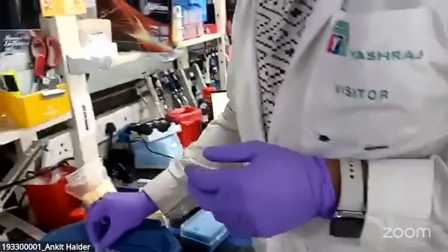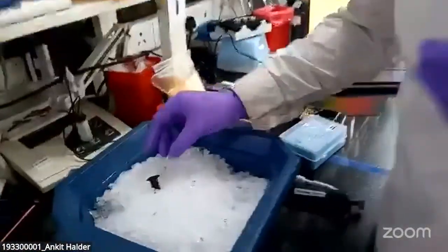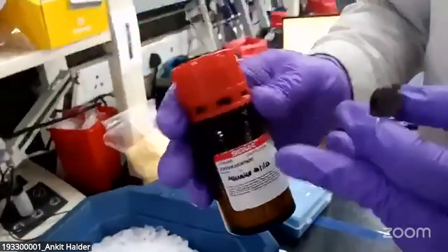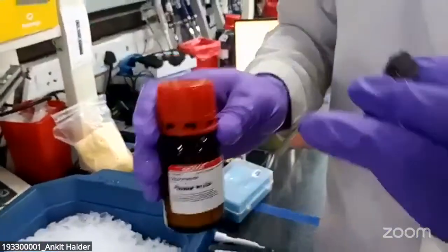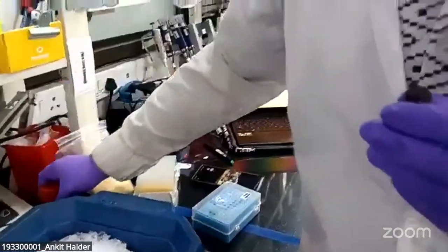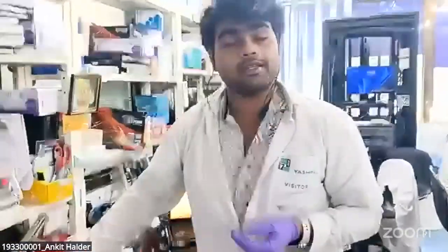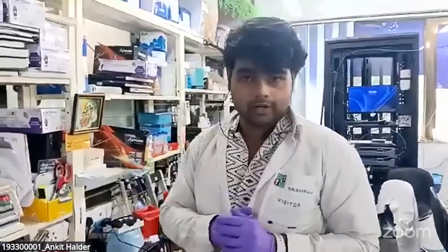After TCEP, you have the IA, the iodoacetamide. So this is the iodoacetamide you can see, and this is very light sensitive. You need to make it fresh whenever you are going to start the digestion. Now, what is the role of IA? IA basically helps in the alkylation. It will prevent the reformation of the disulfide bonds.